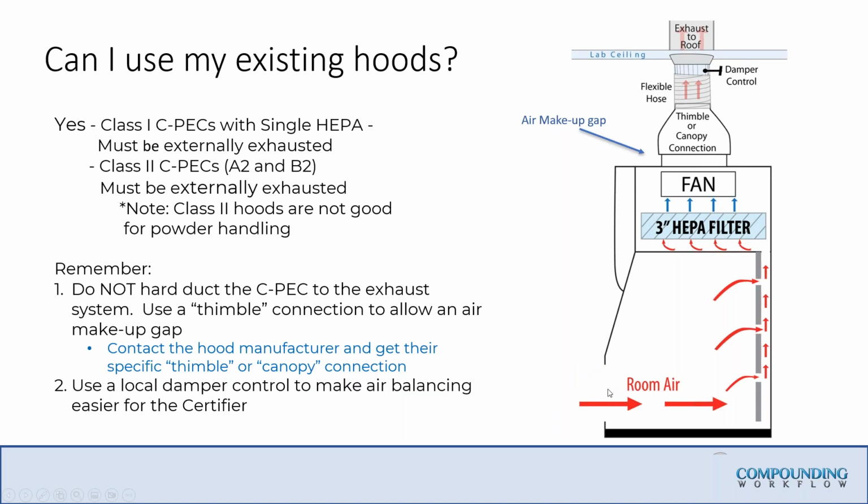That's a low flow, because if you're weighing on a spatula and you start to see your powder whisking off, or your 3 places, 4 places to the right of the decimal analytical balance can't get stability, it's because there's too much velocity on this powder hood. Powder hoods are not like biological safety cabinets. A biological safety cabinet will have 105 feet per minute at the face. You only want 75 to 80 feet per minute when you're weighing out powders, especially hazardous drug powder, because I don't want those blowing all over. And plus, I don't know what the gram cost of hormone drugs are these days. But anyway, slow your powder hoods down. And then also this damper control will keep that exhaust blower on the roof from overwhelming the powder hood as well.